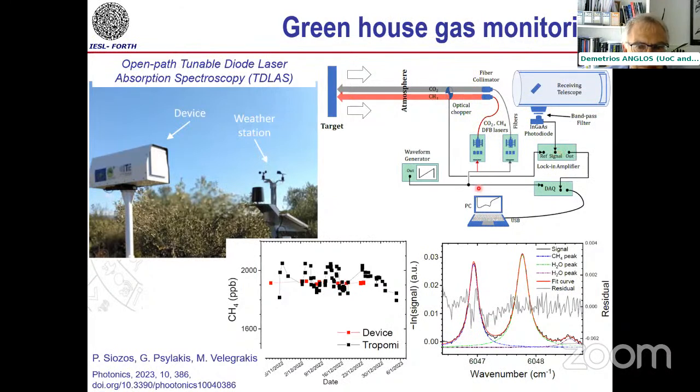And again, here by tuning the laser across a spectral transition, one can take characteristic absorption spectra, for example of methane, water, and so on. These lines that you see here are very narrow. They are actually rotationally resolved vibrational lines. So they come from overtone and combination vibrational transitions, but with particular rotational resolution.